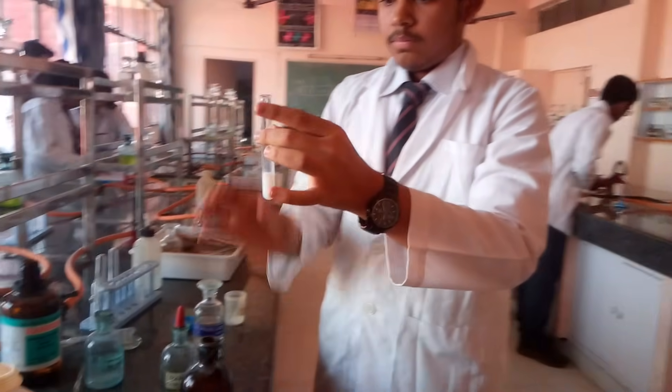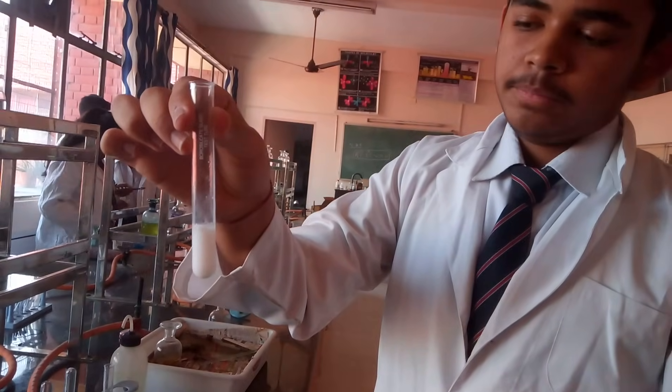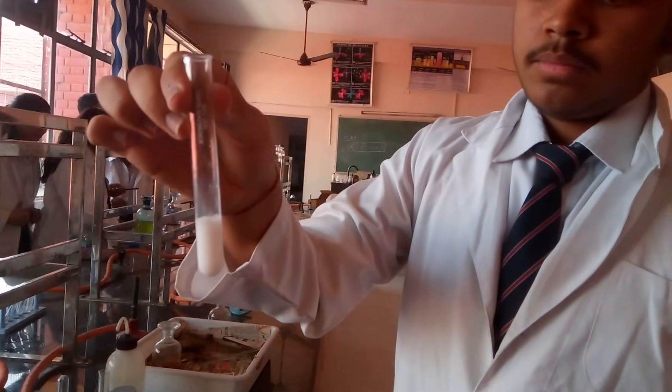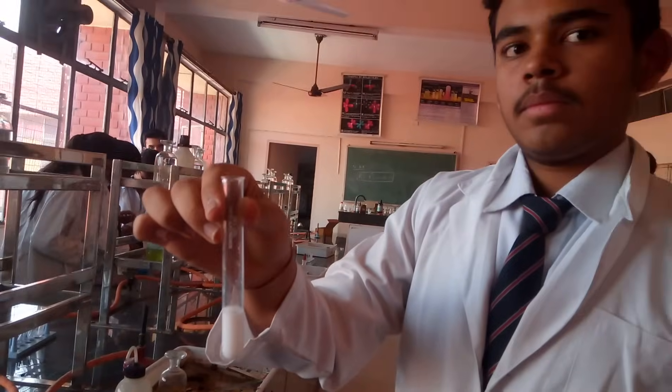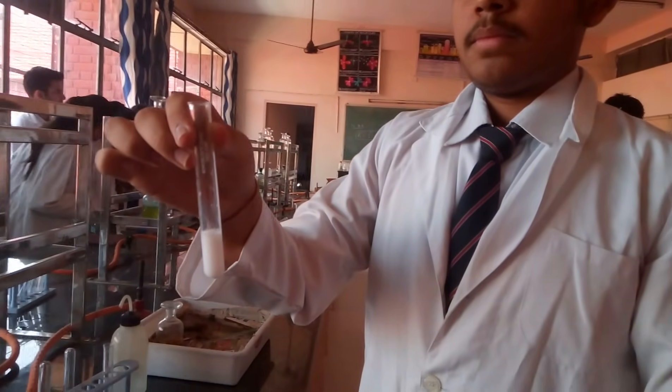On addition of silver nitrate solution, you can see the formation of a white precipitate. This white precipitate is of silver chloride. Now to confirm further, you need to dissolve this precipitate in ammonium hydroxide. Since our aim is to dissolve the precipitate, there is no point in taking this lot of precipitate. Discard half of it.